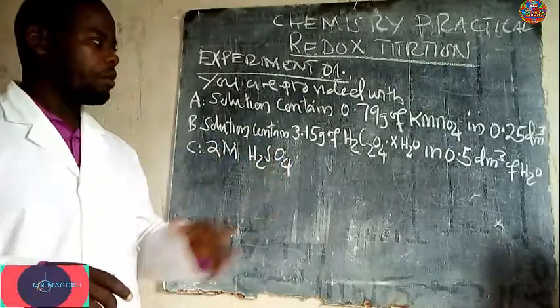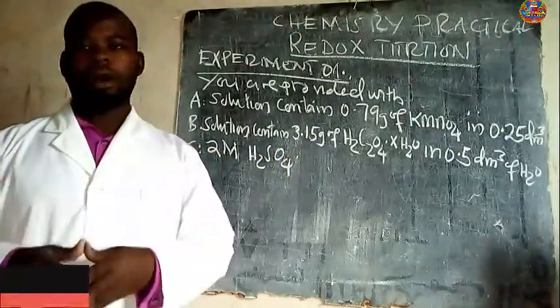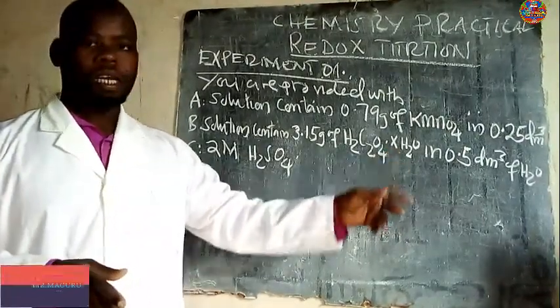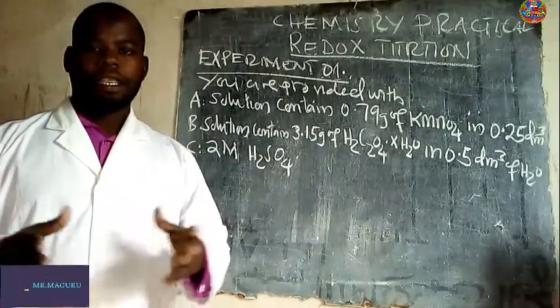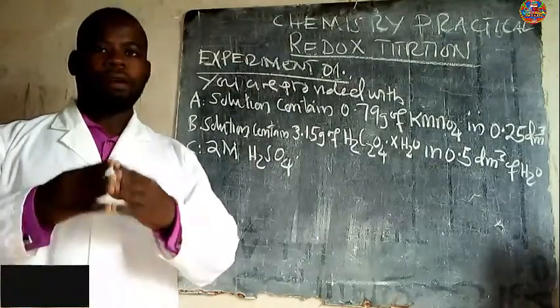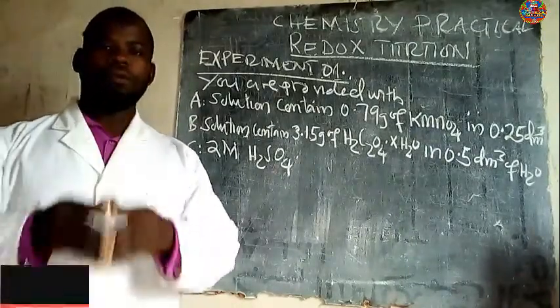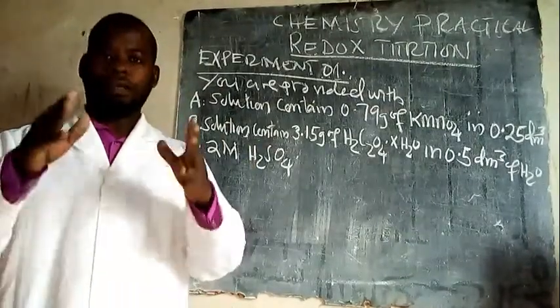So that's our data. In practicals, you will see the procedure one by one. And in this question, you are required to find the water of crystallization of oxalic acid. I think that is enough time. Let's go to the experiment practically. You will enjoy it, and you will understand how to solve these questions. So you're welcome to learn with me.